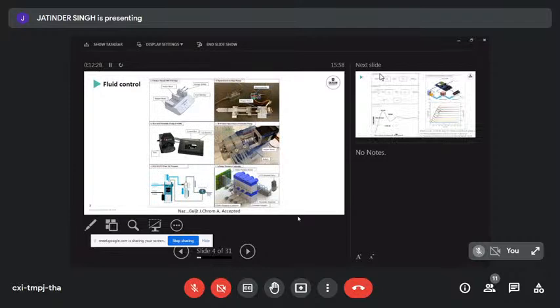We've got a range of different pumps available that we can connect to the outside of our microfluidic device. We'll be touching on some integrated pumps, but integrating a pump into a microfluidic device has proven a rather big challenge. So it looks like the majority of the fluid handling being done uses external pumps and valves.